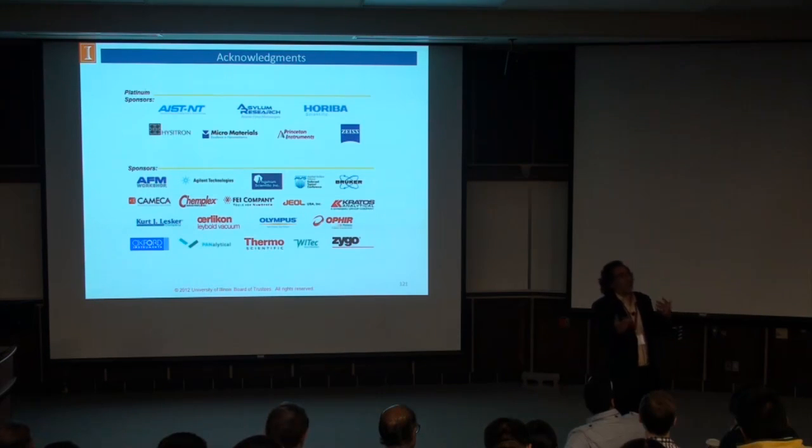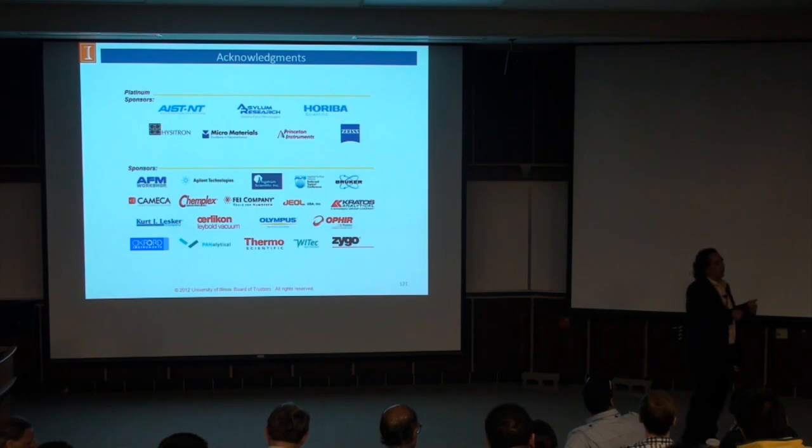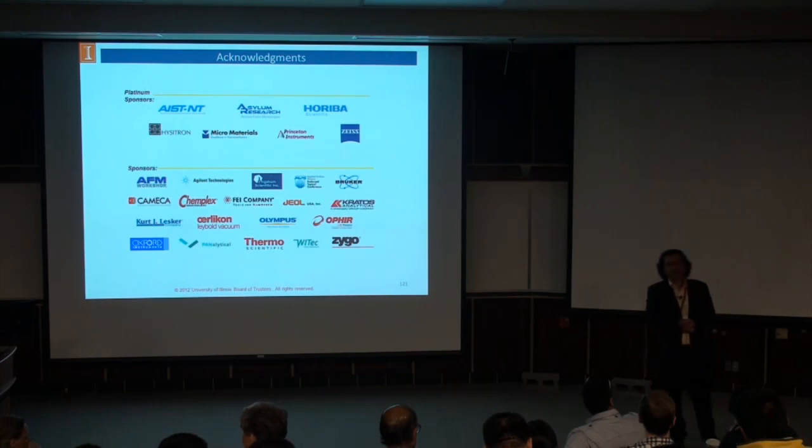If you have a material, for example, like iron oxide, it may not scatter very well, especially iron, so you need to collect longer. I gave you some rules of thumb, but the best thing is, if you come to me at some point, when we know exactly the material you have and which instrument is going to be used, I can give exact specifics there.